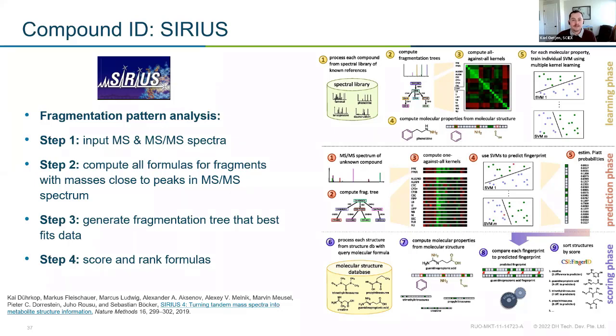And that's where we can lean on tools like SIRIUS to do that. So here we would input all that data, so that MS1 and MS2. We could even put in our structure and use that tool to say, hey, do these fragments make sense? Are they things we would predict when doing CID? Can we be confident enough to move into that level 2 zone where we have a diagnostic ion even? So that's one of the ways, if you don't have spectral information, you can climb up that pyramid a little bit further.